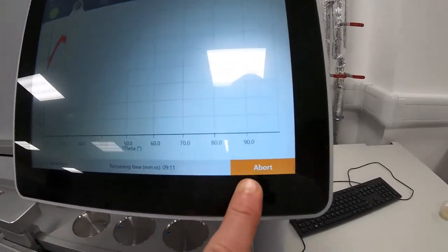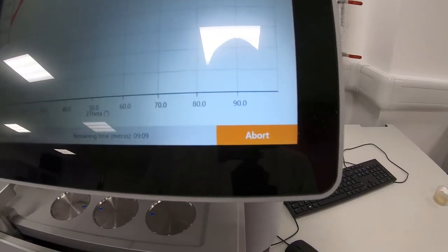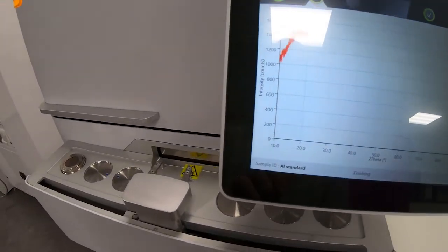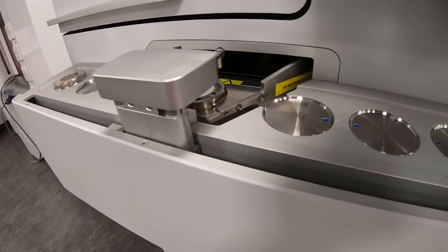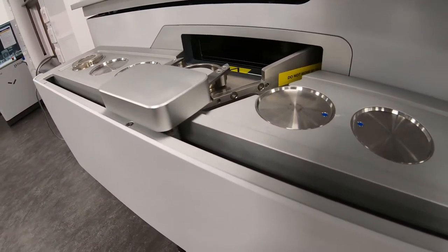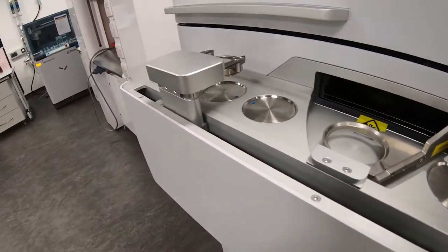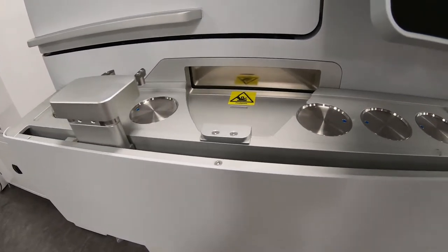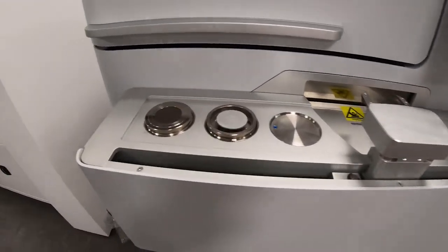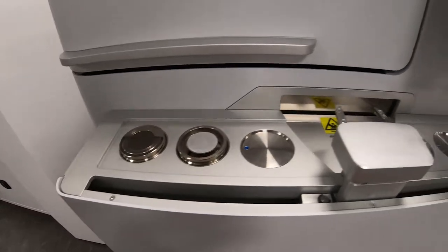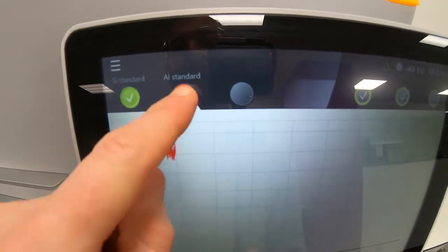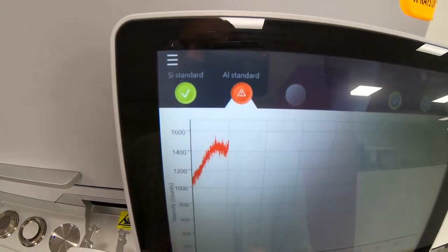If at any time during your experiment you realize you've put the wrong sample in or you need to stop it from whatever happening, it's quite simple. Just press the abort button here and that aborts the data, stops collecting, opens the shutter and removes your sample. That goes away and the door shuts and back into the middle and you can take your samples away. You can see on the screen there's this red exclamation arrow because it didn't finish collecting the sample because you aborted it. That's fine.